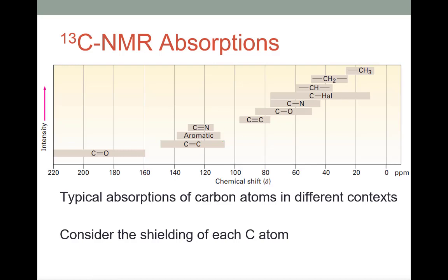The aromatic ring region, around 120 plus kind of area, is going to be very important, especially for branching patterns on an aromatic ring. And very high absorptions over here are going to be indicative of aldehydes, carboxylic acids, that kind of stuff. So very high on ketones, carbonyl groups. So keeping those sort of 3 generalities in mind and the overall concept of shielded and deshielded and symmetry, carbon NMR can really help you to identify the skeletal structure of your molecule. And by that way, to help identify between closely related isomers.